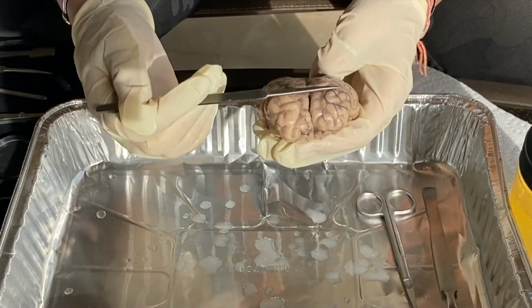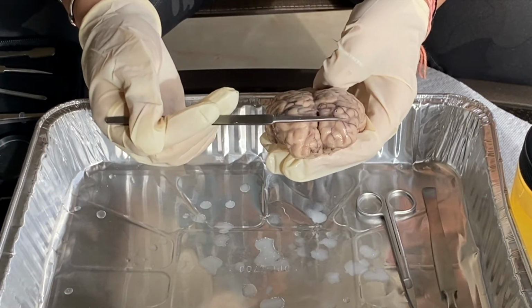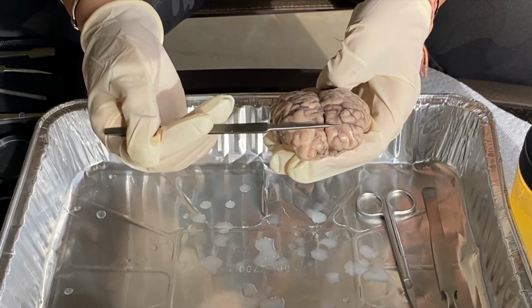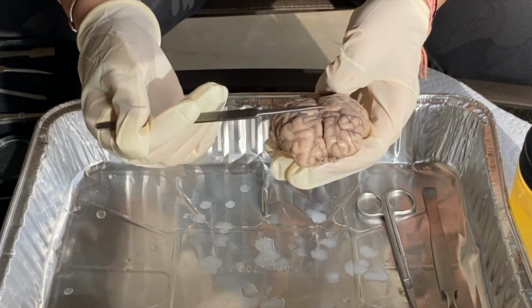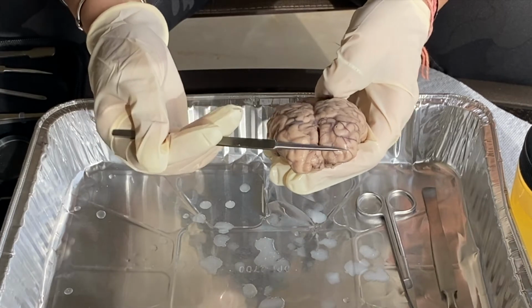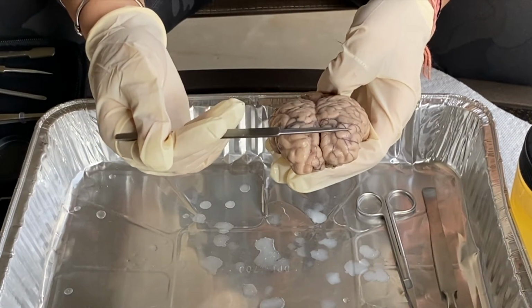So the frontal lobe has functions in voluntary movement, in expressive language, and managing higher level executive functions like the ability to organize, plan, self-monitor, and it contains the primary motor cortex.